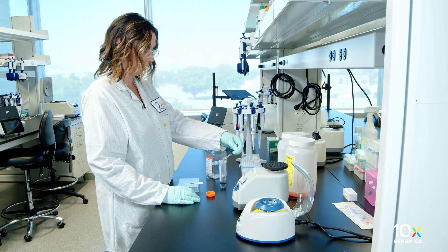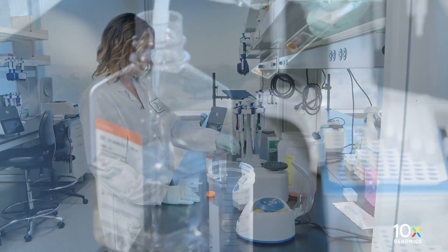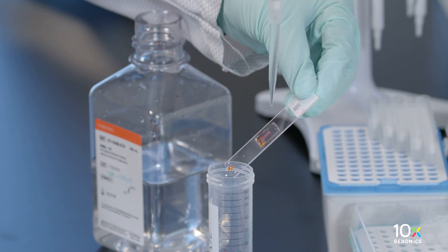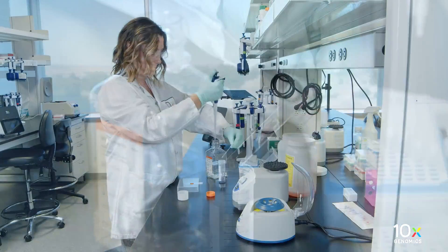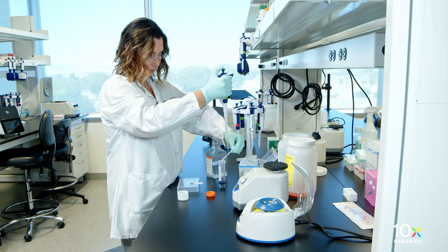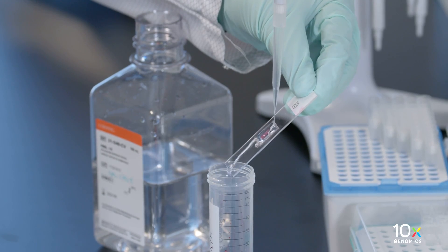Remove the 10% eosin by holding the slide at an angle over a liquid waste container. While holding the slide over the liquid waste container, rinse the slide with 1 milliliter of 1x PBS. Do not pipette directly onto the tissue. Repeat two more times for a total of three washes.